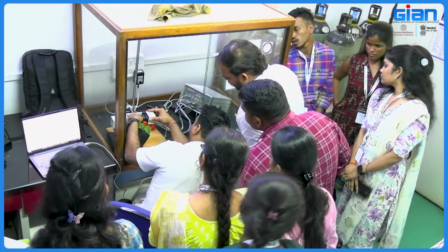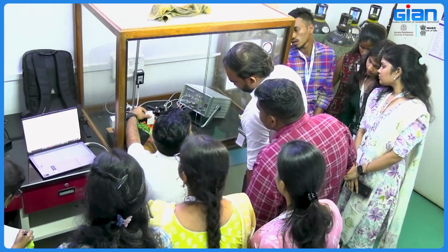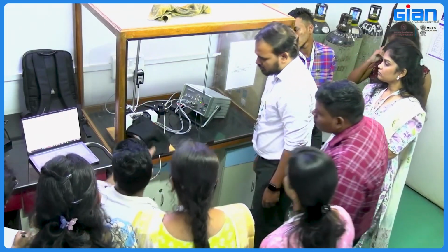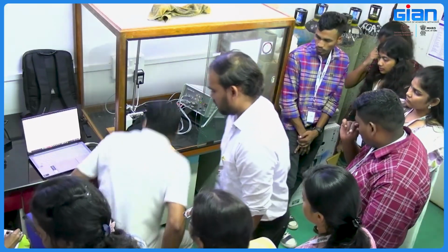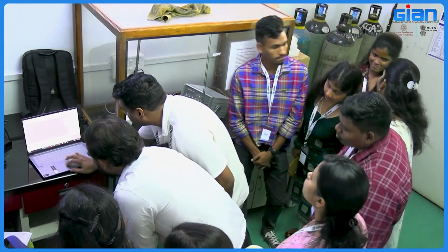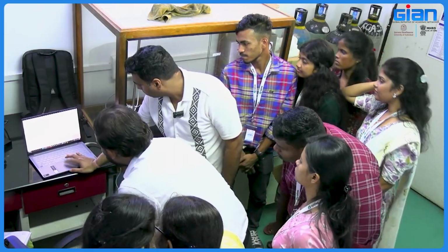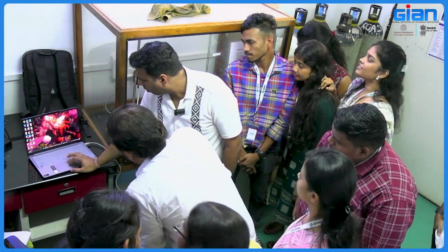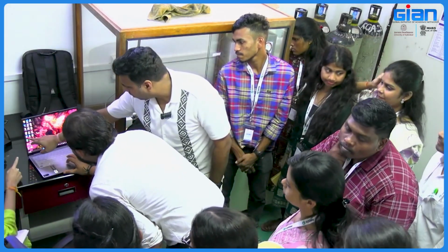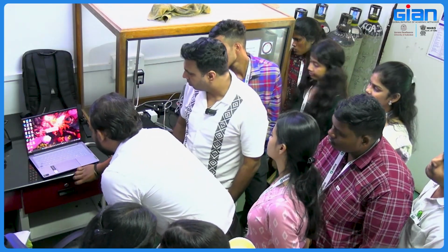So don't expect the Fv by Fm to be more than 0.79 or 0.8 because it's already exposed to light. Just for demo purposes, I'm showing you. Great. Okay, so this is the first, I'm closing it. Just open this program, P700. This one, dual PAM, P700 and Fluo. So this.